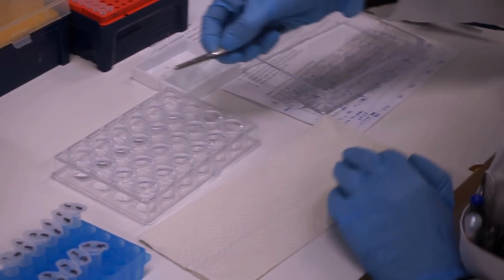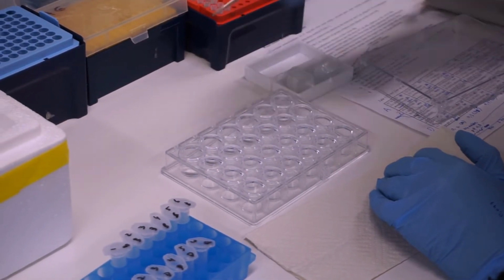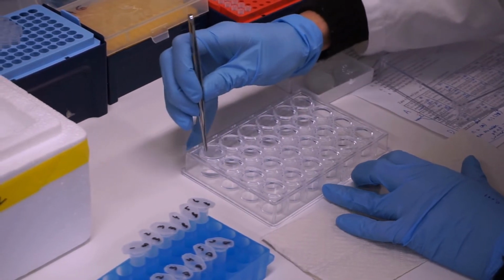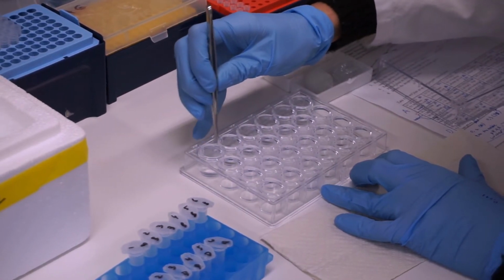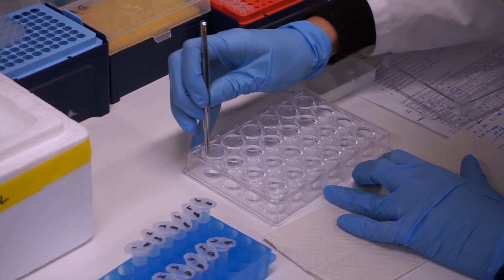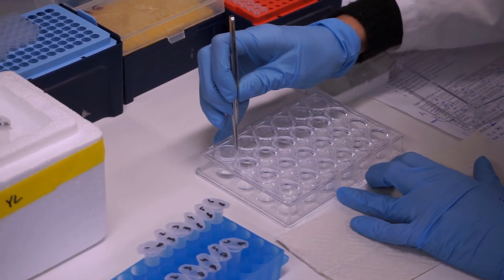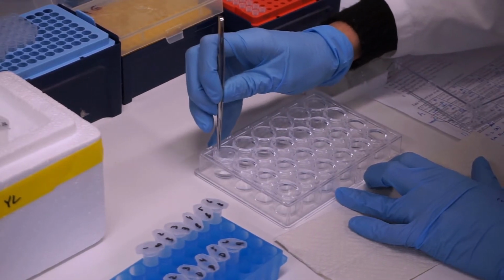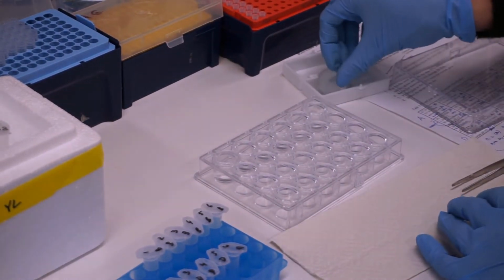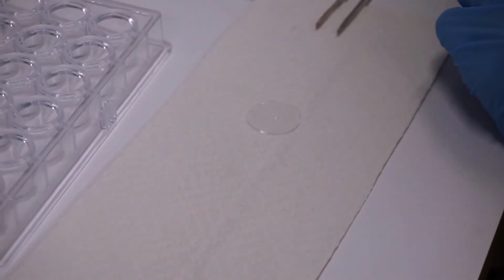By holding the cover slide with forceps, carefully yet without delay, invert the cover slide so the drop is hanging from the cover slide. Position the cover slide onto the bit of grease on the reservoir. Gently press the slide down onto the grease and twist the slide. Repeat this for all other reservoirs.